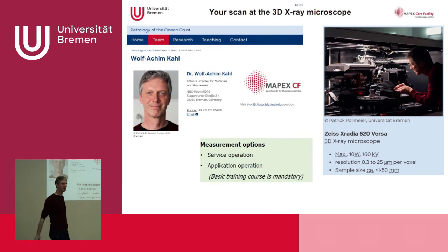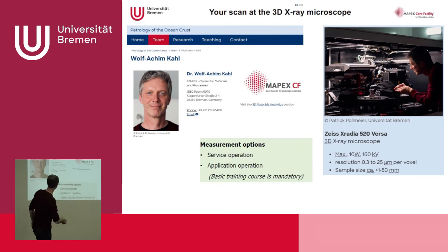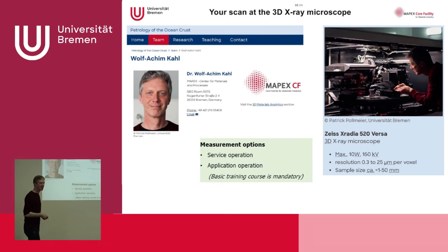The colleagues from the Bremen Hochschule, for example, are coming often and do a lot of measuring, so they know how to do it, and they can use this X-ray 3D microscope in application operation. Or if you say, I don't want to bother with all this technique, you give me the samples, you contact me, we have a chat, and then I do a service operation, which is also very handy, and then you get these kind of image volumes which you can inspect with several programs.